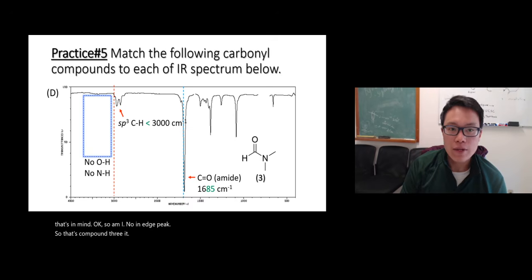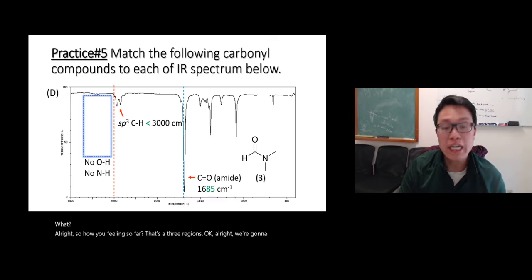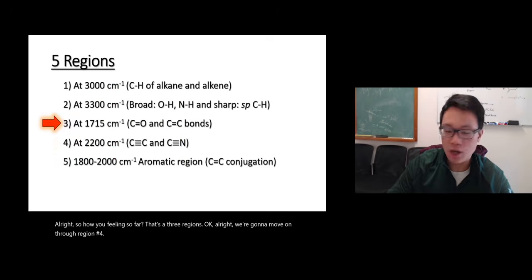All right, so how are you feeling so far? Those are the 3 regions. Okay. All right, we're going to move on to region number 4. Let's see what we got. What's going on here?